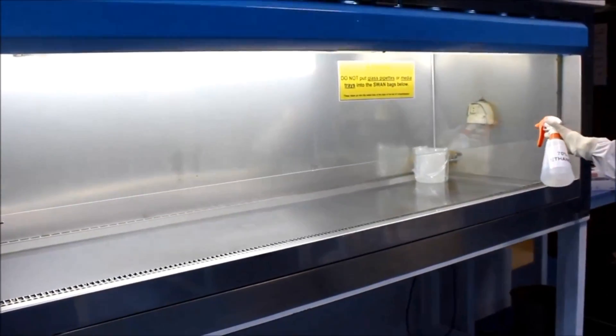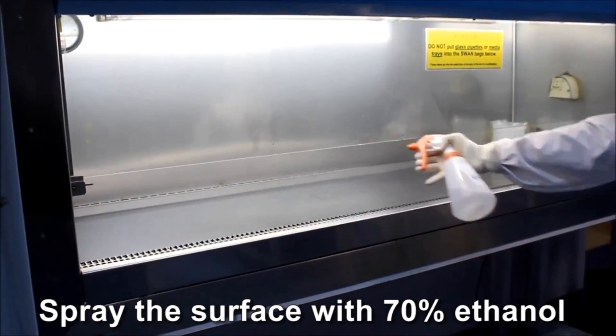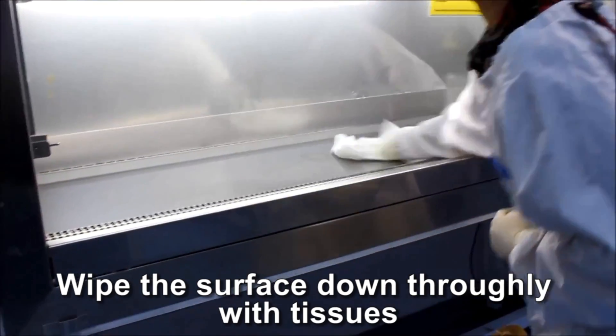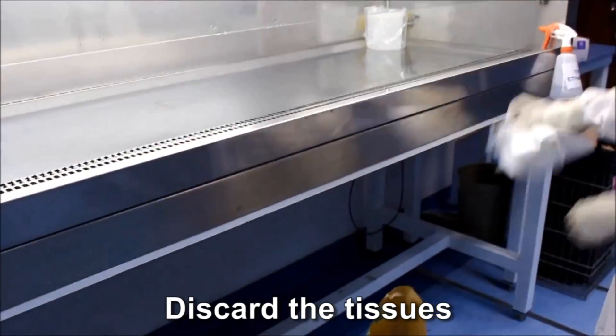Whenever placing your hands into the hood, make sure you are wearing gloves. Spray the surface of the cabinet with 70% ethanol. Wipe it down with tissues. Dispose of the tissues into a swan bag.